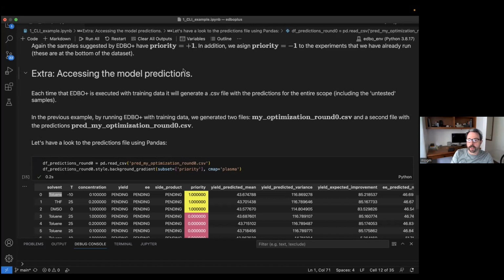And if you're going to use descriptors from molecules and stuff like that, you'll have to include those, and how you define your search space. I imagine it would be a good idea to think about what the best practices are. Yeah, and having a Google Doc where we list the information that you'd want to provide. It's a good question.